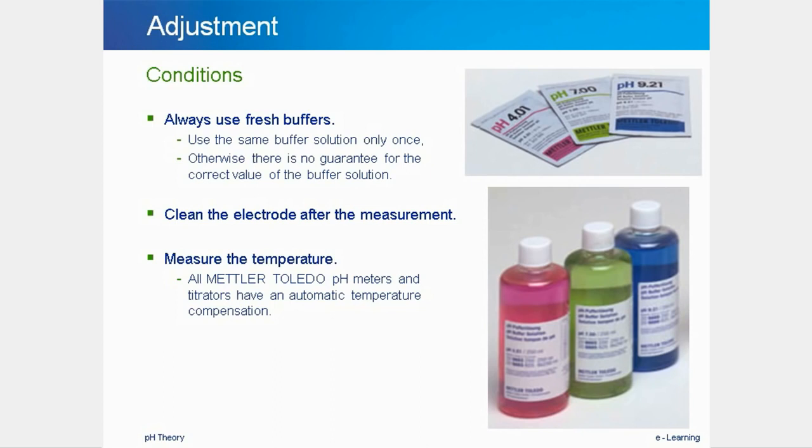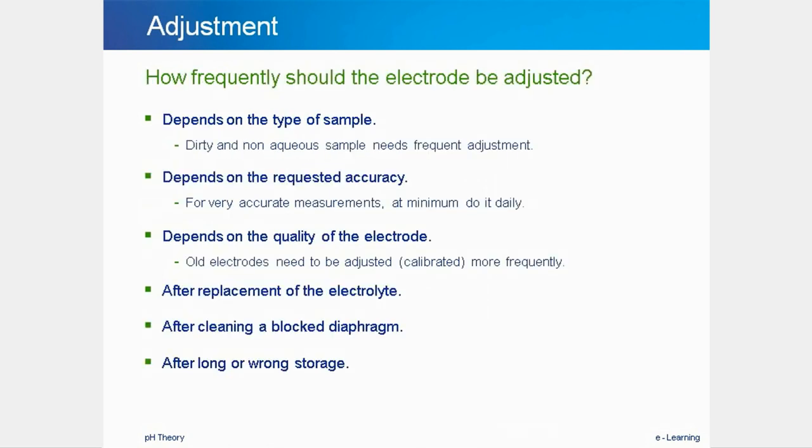This lookup table is used automatically in the meter when the settings are on automatic temperature correction and if the buffer settings are set to the standard buffer groups.